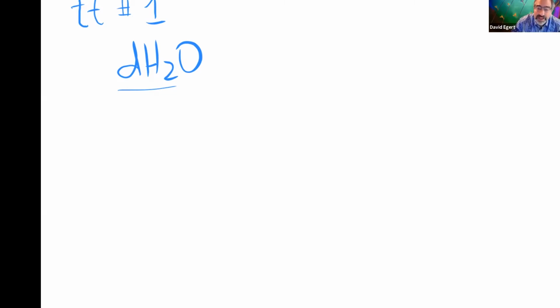All right, so if I have a test tube with distilled water, what is the osmolarity of this one? Zero. Because osmolarity is the number of particles per liter of solution, and this is just pure solvent. There's no solute at all. There's nothing dissolved in there. By definition, distilled water is just the pure solvent without any solute at all. So this has zero osmolarity.